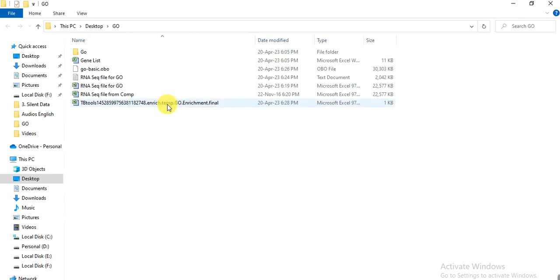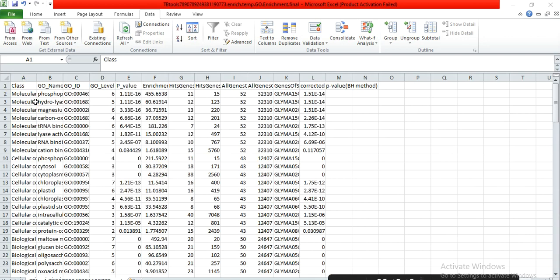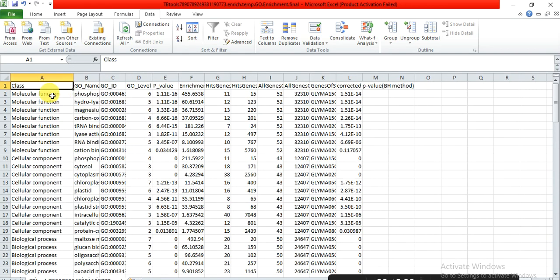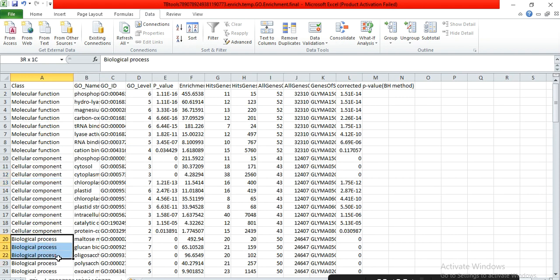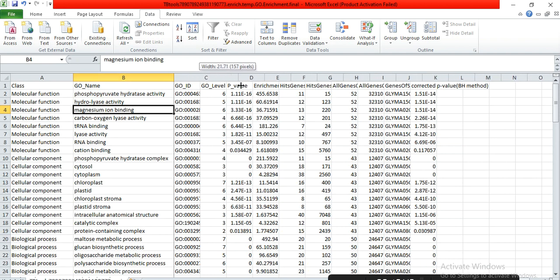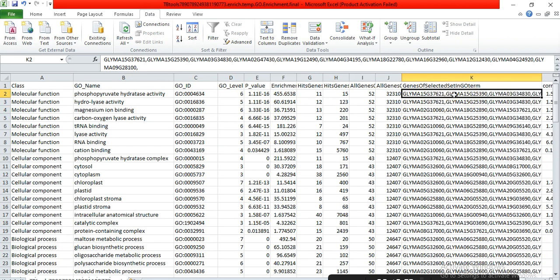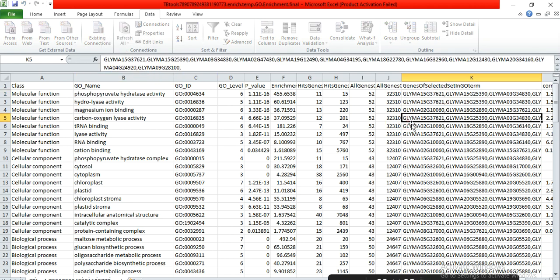Now open the output file. This file shows which class each gene belongs to — molecular function, cellular component, or biological process — along with the gene ontology description, GO ID, p-value, and the list of genes from your family gene list that belong to each category. For example, some genes belong to molecular function.